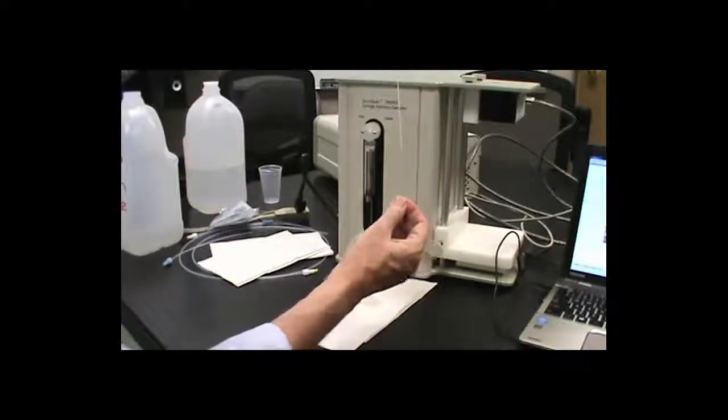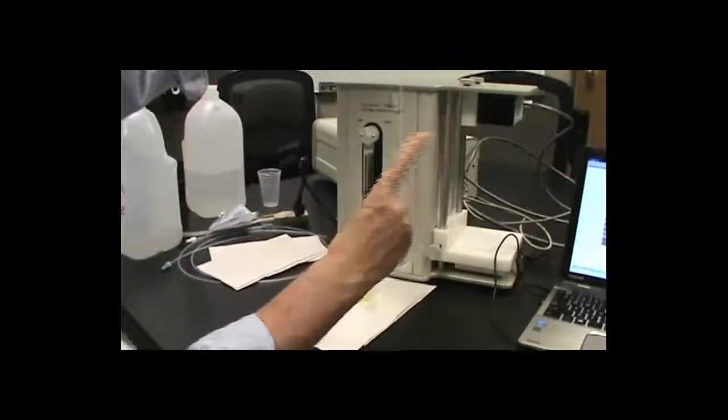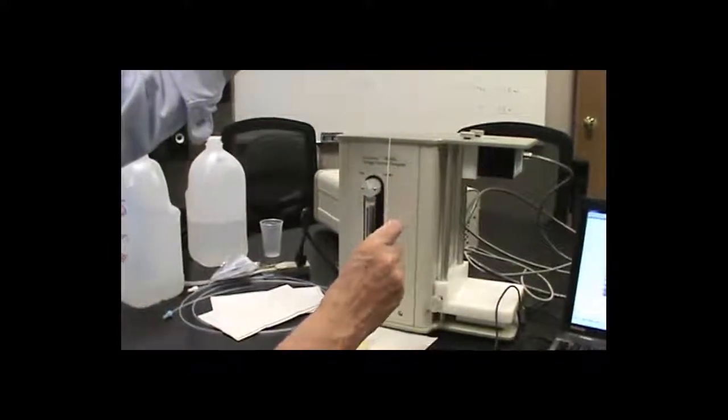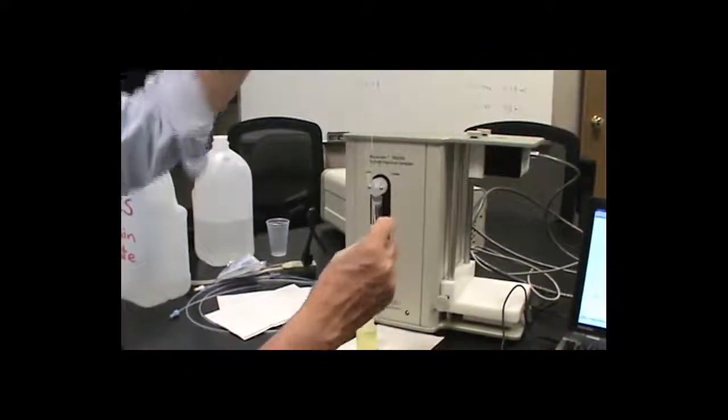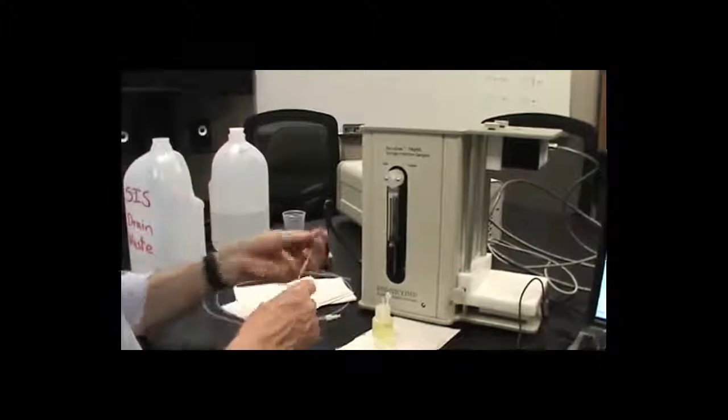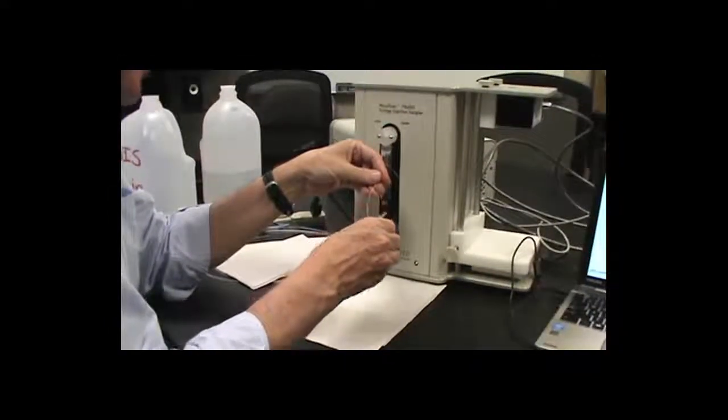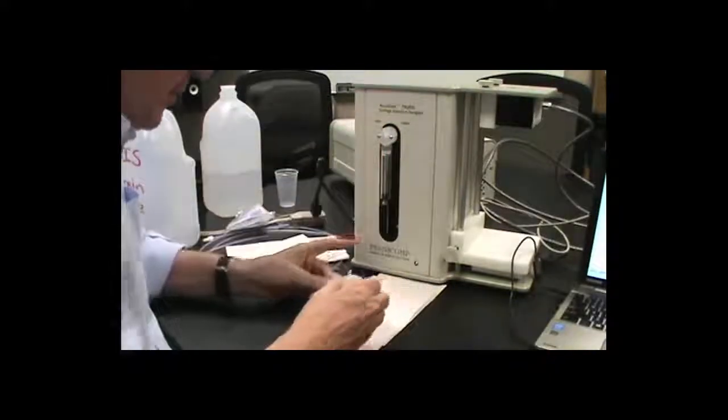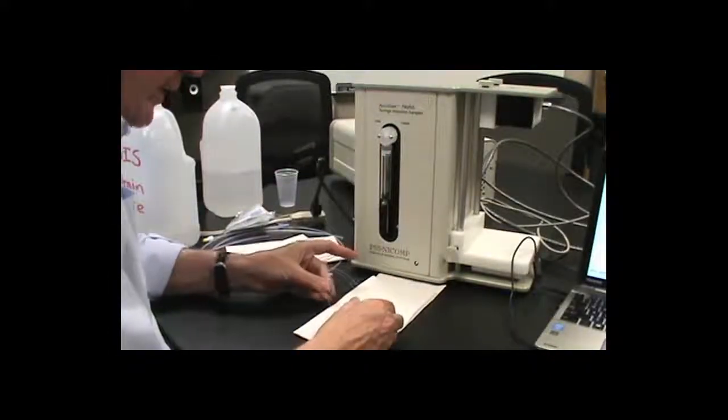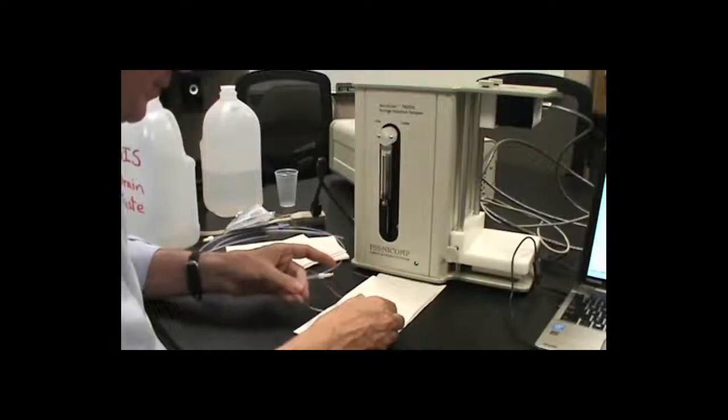You'll see that it is asymmetric. Down here at this end, it is thicker. What I'm going to do is wet that part of the cleaning cloth. This bottle comes with your system. This is the cleaning fluid, and I'm just going to wet that with the cleaning solution.